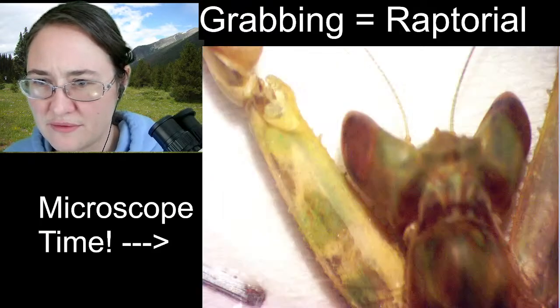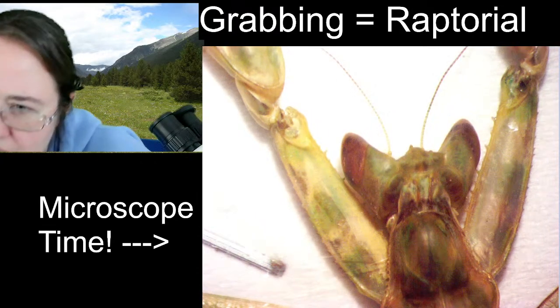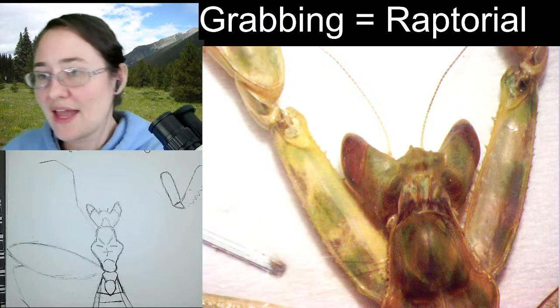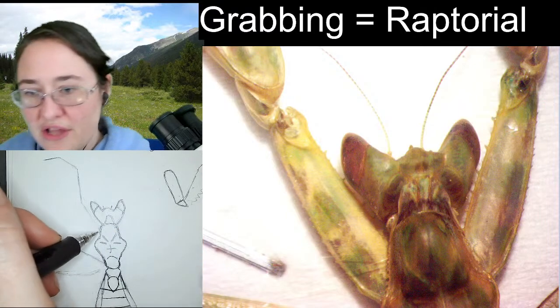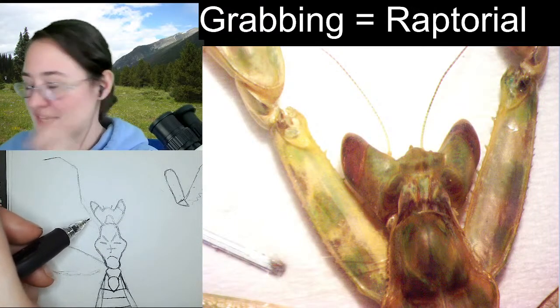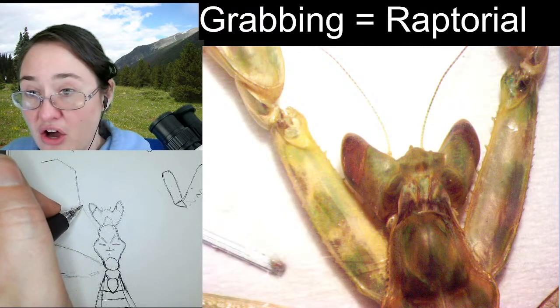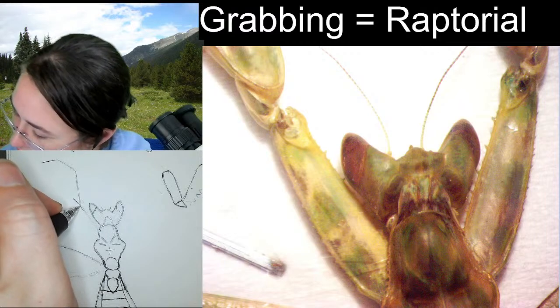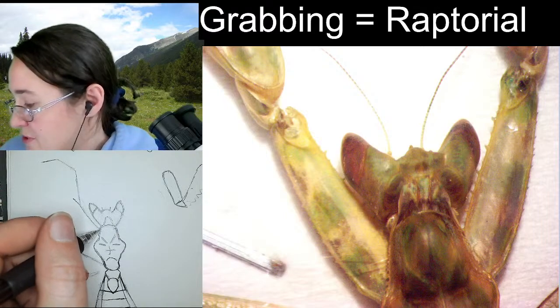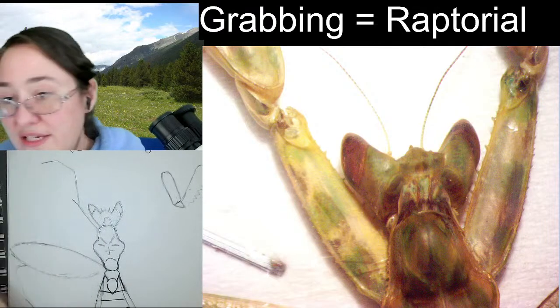Zoom in just a little bit. From this view, I can see the coxa, the procoxa, and the protrochanter. The coxa is coming out from our pronotum right about here. It's nice and wide at the base. Very, very strong mantis. So we're going to start at the front of it. It goes a little bit longer than the eye, so we're going to start it up there, bring it all the way back to the top of the pronotum. I'm making it just a little bit wider so it's not sitting exactly on the head. That's just an artistic choice.